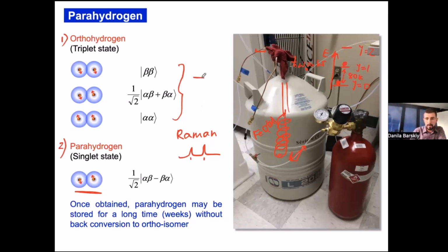So we have hydrogen gas flowing, let's say, after a generator, and it can go into an NMR tube, and we can have outflow, and we also have some pressure valves and safety valves, such that we can control pressure in the tube. We are just looking directly, this is our RF region in an NMR tube, by NMR at the tube through which we are flowing hydrogen gas.